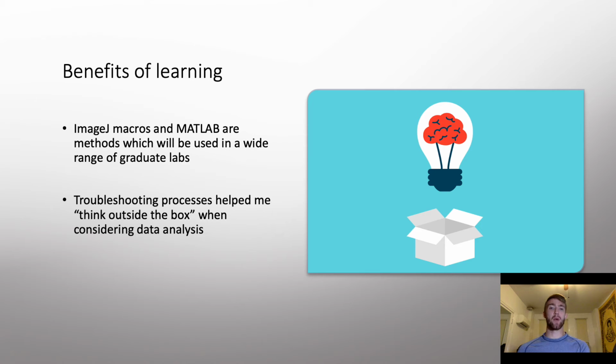So I think the primary benefit to my learning was just this experience with working with ImageJ, analyzing images, and its relation to neuroscience. I get a better understanding of the techniques and methods used, like photometry or DREADD, by just working through the data from them. And these methods are widely used in neuroscience for circuit level analysis, which is something I plan to do throughout my career.